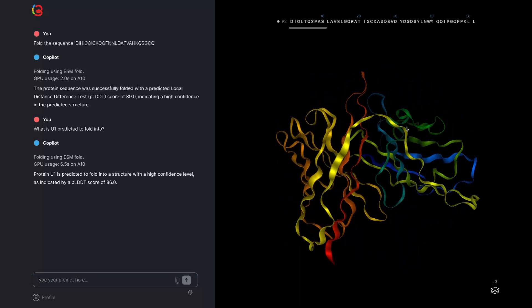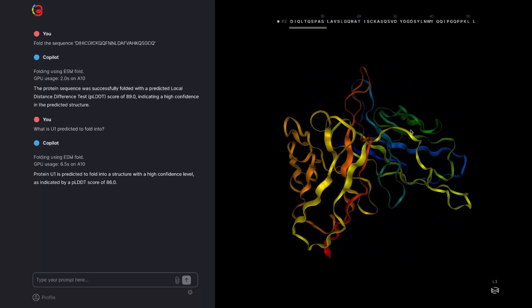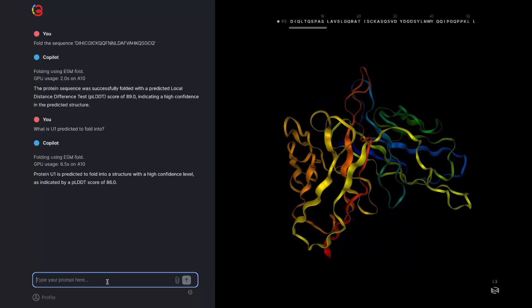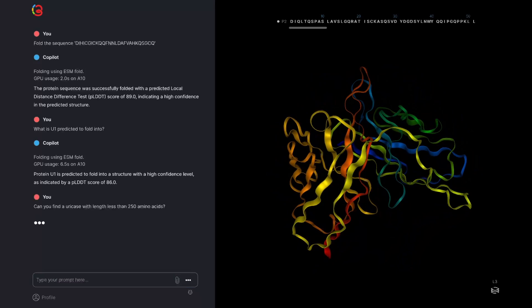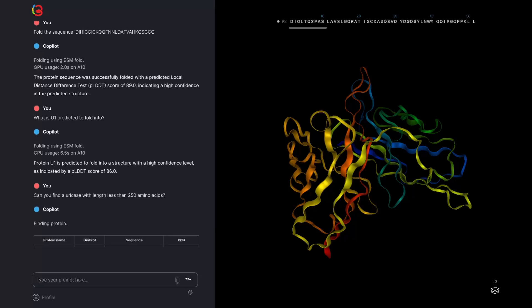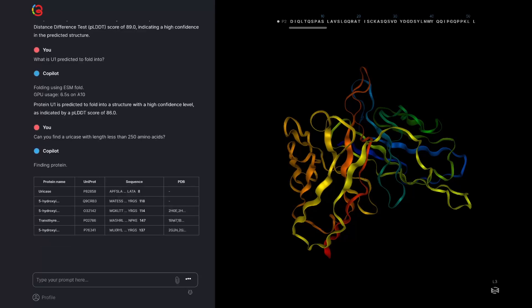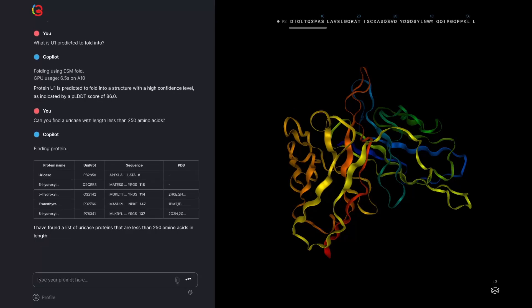A third option is to search Uniprot for a starting point. For example, I can ask Copilot to find a urease with length less than 300 amino acids and it will show me the top five results.